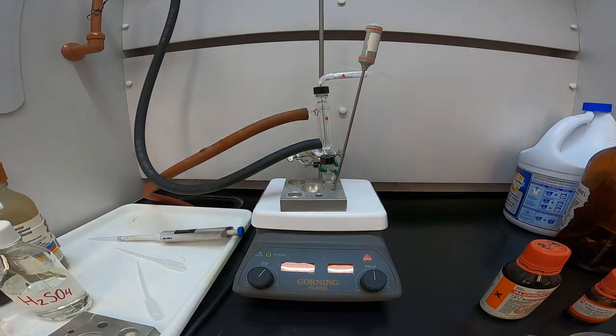So I'm going to take it apart, and the next steps will be what's called the isolation and purification of the product. In those steps, we'll take the whole assembly apart, and then we'll add ether, which allows the product to dissolve in the ether but not the reactants. And then we'll also add about 2 milliliters of 5% sodium bicarbonate, which will cause any excess reactant to be neutralized. So anything that's water soluble will stay in the aqueous layer associated with the bicarbonate solution, and our product, the isopentyl acetate, that's not water soluble, will be collected in the organic layer. So once I get this apart, I'll start over again and show you the transition to isolating, and then we'll move on to the distillation to purify the product.